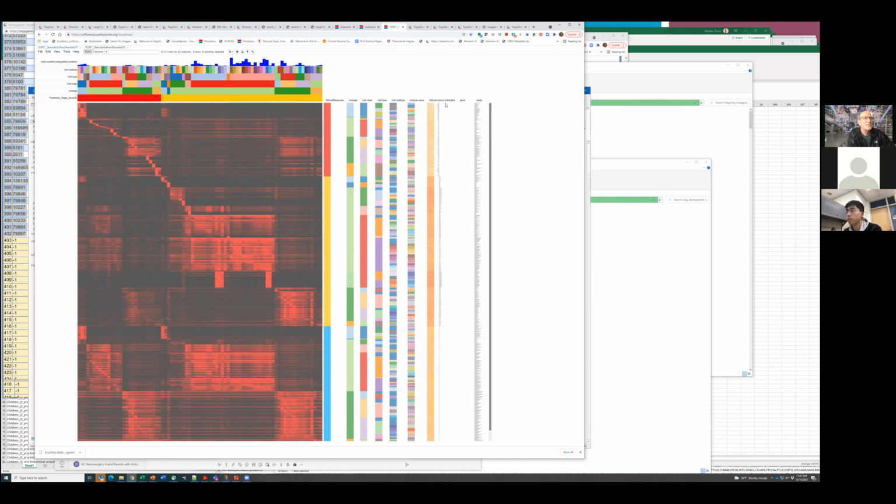So here's steroid minus untreated, and here's a bar graph plotting the difference between the value of the gene's maximal expression in the no steroids condition versus the with steroids condition. In this case, these are all minus numbers because the genes are all in this block here. They're all strongly downregulated by having been treated with steroids.